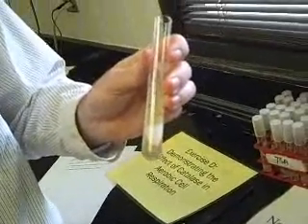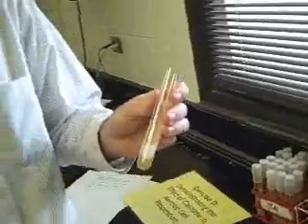And remember, all organisms that use aerobic cellular respiration have to be able to get rid of hydrogen peroxide. One of the ways that they do it is catalase. So that means that Bacillus megaterium probably does aerobic cellular respiration, and we know that because of its catalase. There are some organisms that do anaerobic respiration that have catalase, but they're not particularly common.